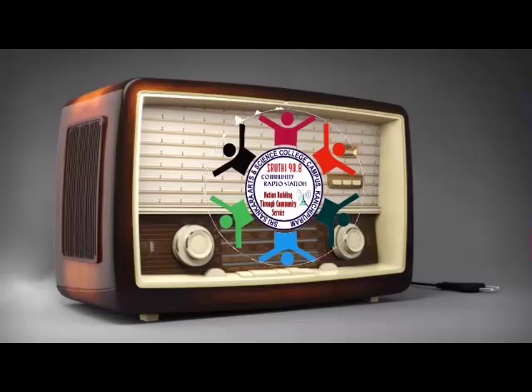The exact definition for a bioreactor is an apparatus used for growing organisms such as bacteria or yeast that are used in the biotechnological manufacture of many substances like pharmaceutical products, antibiotics, vaccines, and for the bioconversion of many organic wastes. Next, we should know about fermentation. It is nothing but a metabolic process that converts sugar materials into either acids or gases or alcohol. Most fermentations are carried out by bacteria and yeast, and it is used for the production of a variety of chemical products.